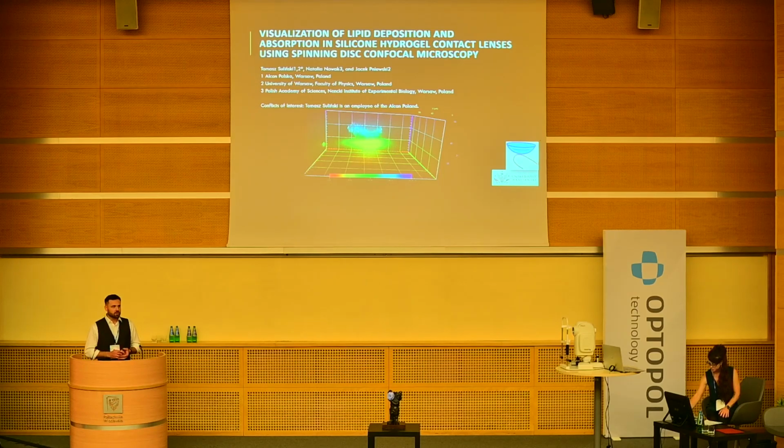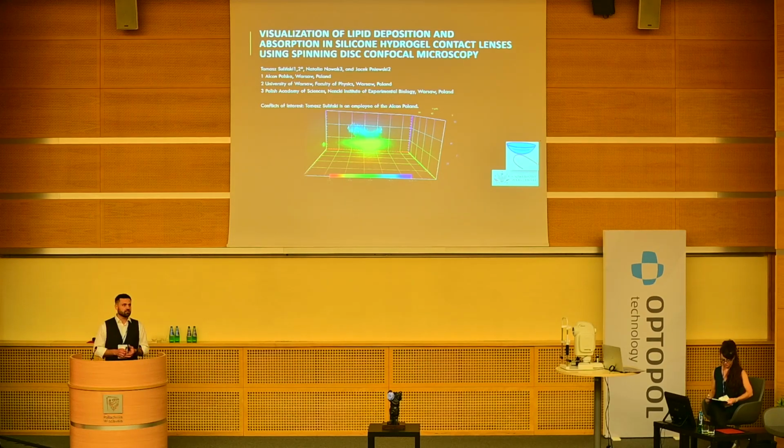So today I'm going to talk about the visualization of lipid deposition and absorption in silicone hydrogel contact lenses using spinning disc confocal microscopy. What is most interesting in this preliminary study, part of my PhD study, is that we wanted to check if diffusion is a good model to describe the very first time after lipids attach to the lens surface and then diffuse into the lens matrix.